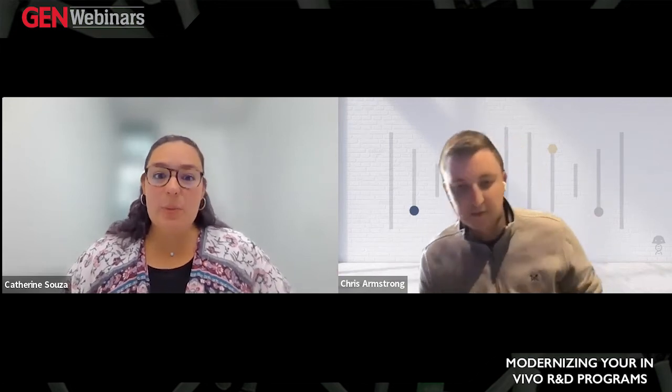The biggest difference would probably be IVIS imaging and integrating that into the software somehow. We are starting to use IVIS imaging quite a bit more. And unfortunately, with the two software, we haven't found a good way to mix that yet. I know that we've spoken briefly about it before, but I think including those data sets in there would be really beneficial. Right now, it's a long and tedious process, and you can't get all the metadata when you take the images.